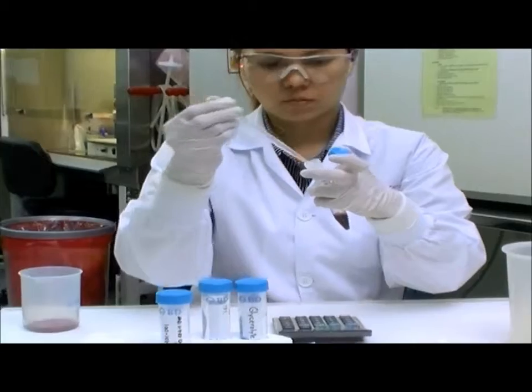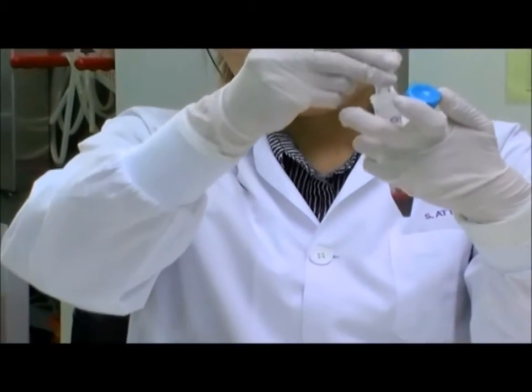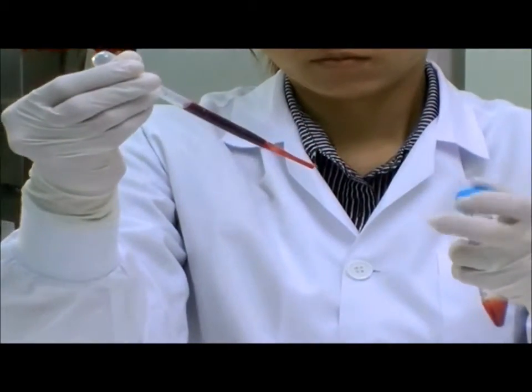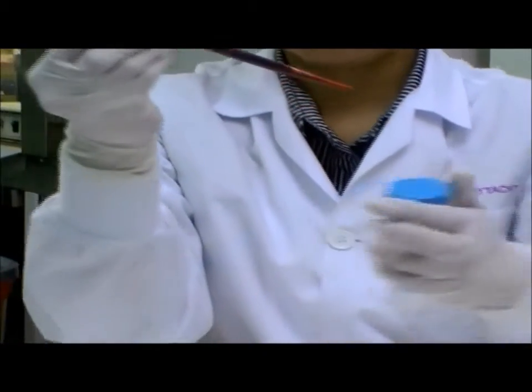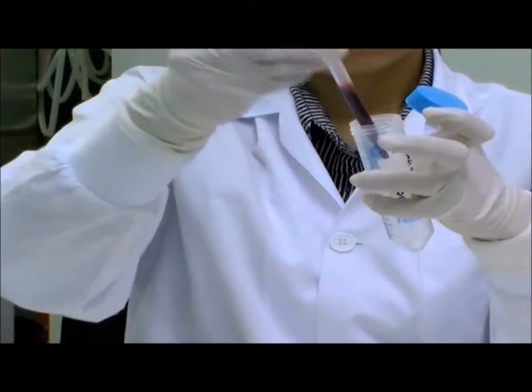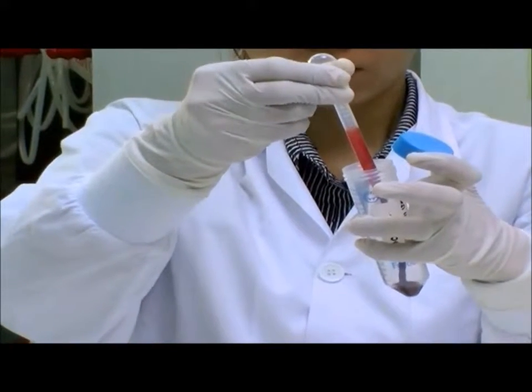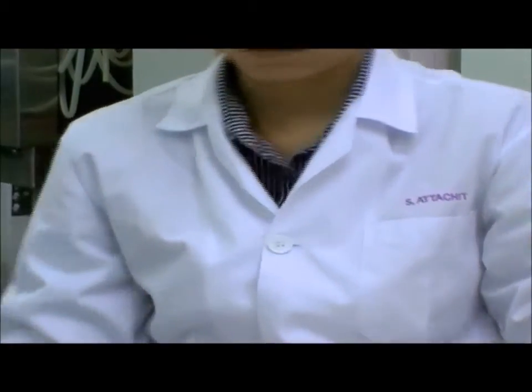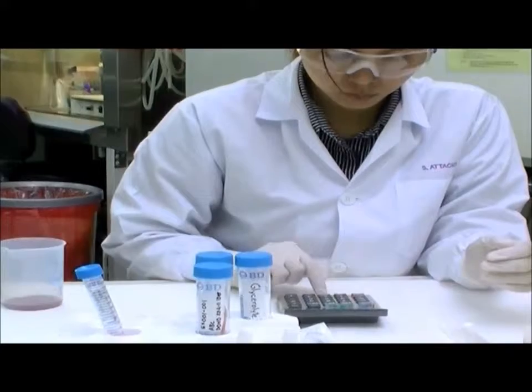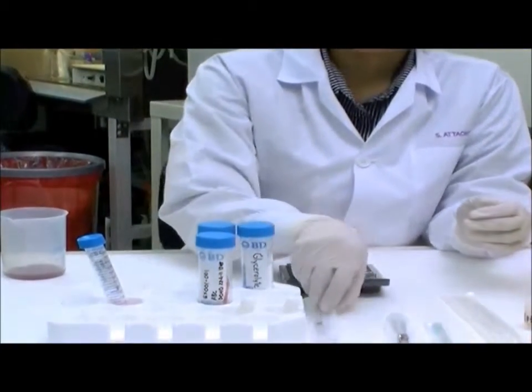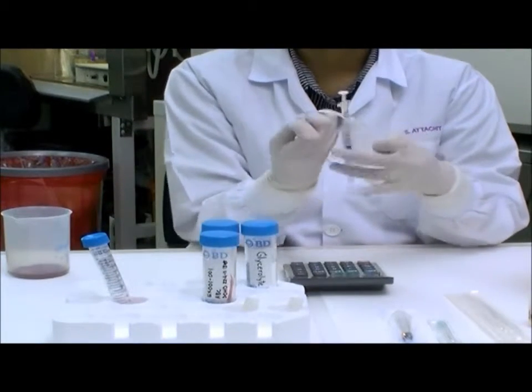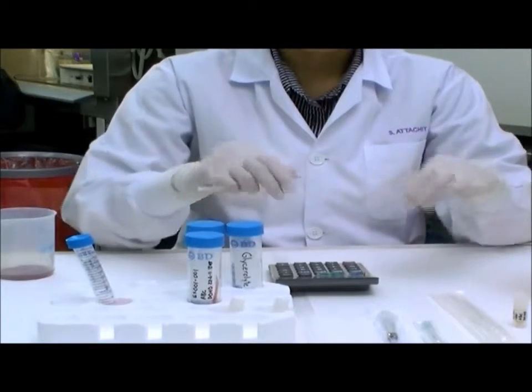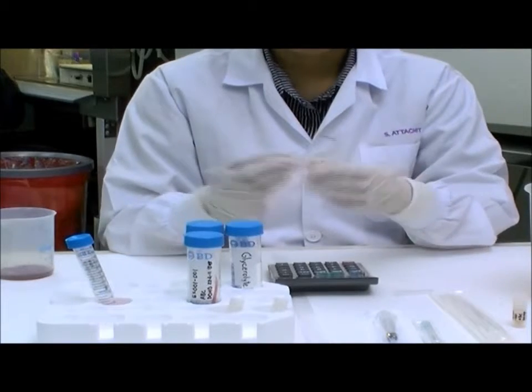Transfer the packed red cells from the 15 ml centrifuge tube to the 50 ml centrifuge tube. While transferring, estimate the volume in milliliters of the packed red cells. Multiply the estimated volume of packed red cells by 0.33. The result is the volume in milliliters of glycerolite which is added initially to the packed red cells. For example, if the volume of the packed red cells is 1.5 ml, you will add 0.5 ml of glycerolite to the cells.